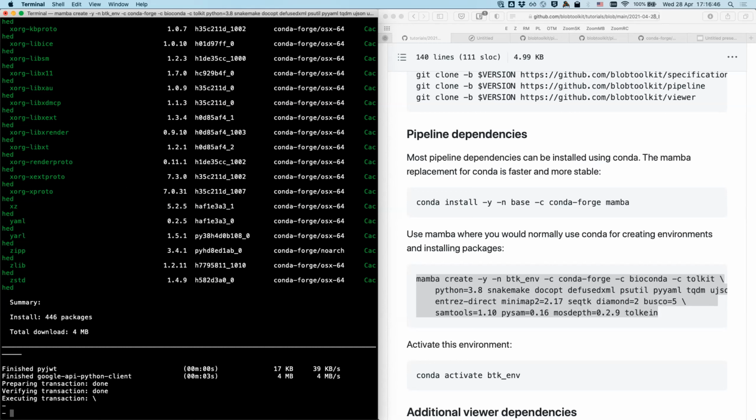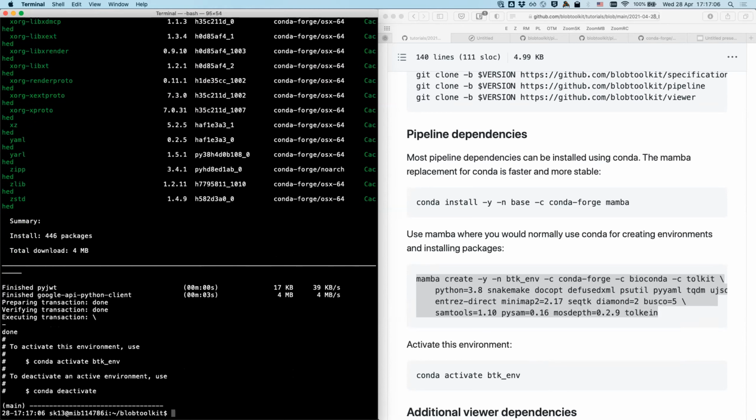Feng, let me know if it gets to the next stage, because it would be nice to have everybody on the same page, and we can chat meanwhile about all the different dependencies and anything. Juliana, did yours finish or is it still running? So this step we have done already with conda. Do you recall? Yes, but it might be nice to copy and paste this particular command with Mamba. I'm trying to think if anything has changed.